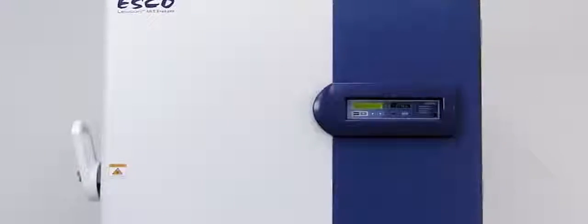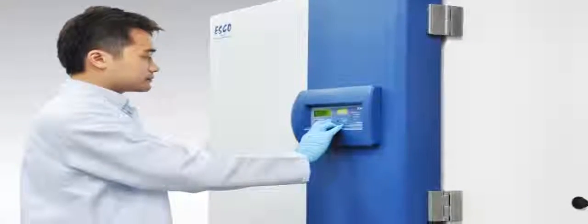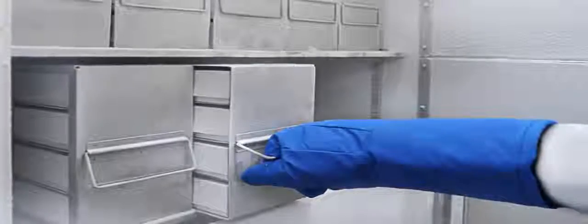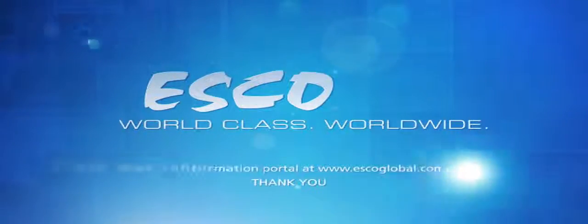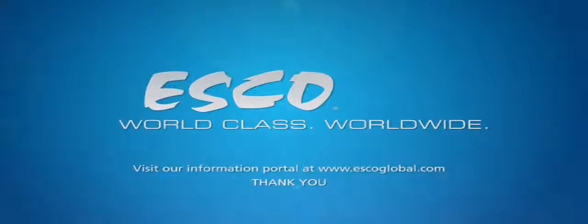These and many other features make the Esco Lexicon ULT freezer an optimum solution for your ULT freezer requirements. For more information, please visit our website at www.esco-global.com.